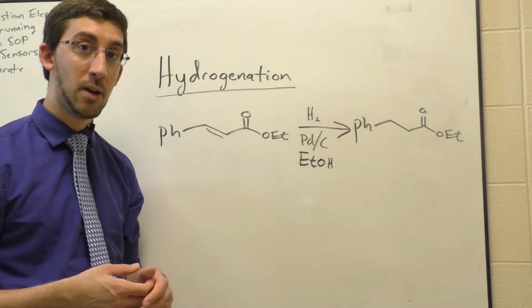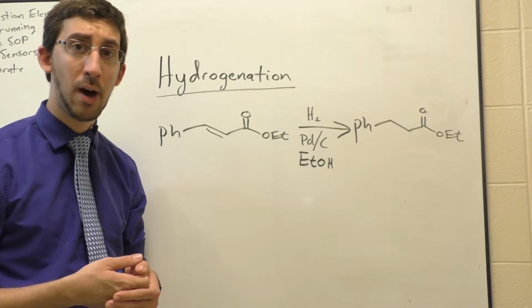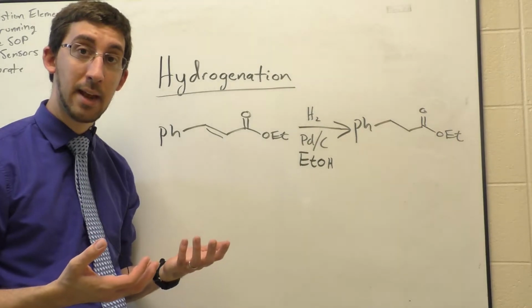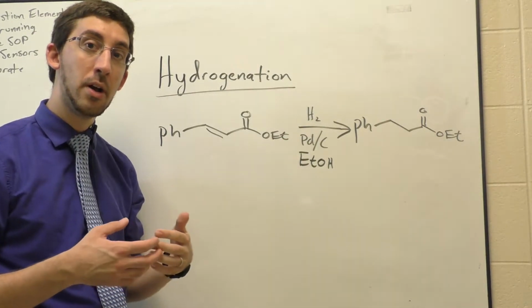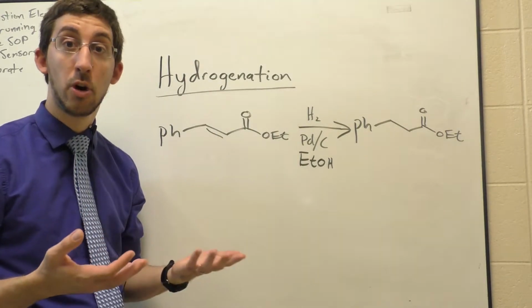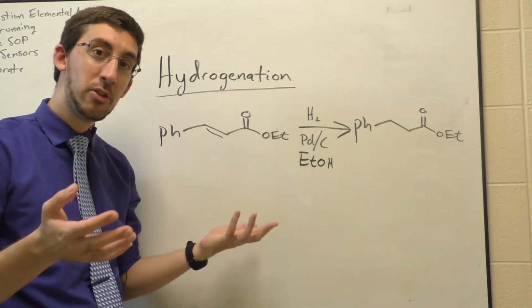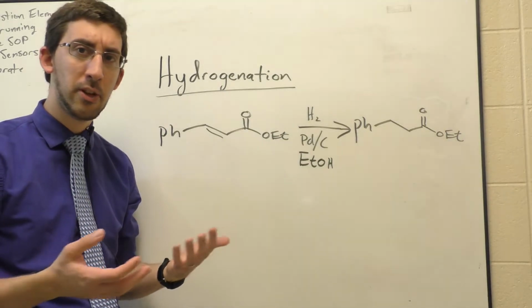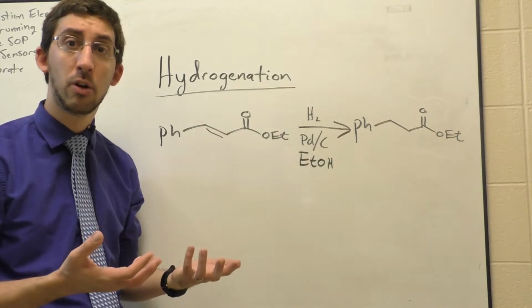Now it turns out that not only is this simple on paper, but it's also a very simple operational experiment in lab. All we need is an active catalyst, which in this case turns out to be palladium metal, dispersed on a carbon support. That carbon support is actually just charcoal, and we've dispersed the palladium so that we get higher surface area and a more active catalyst. It's generally dispersed as maybe 10% by weight or 5% by weight on charcoal.